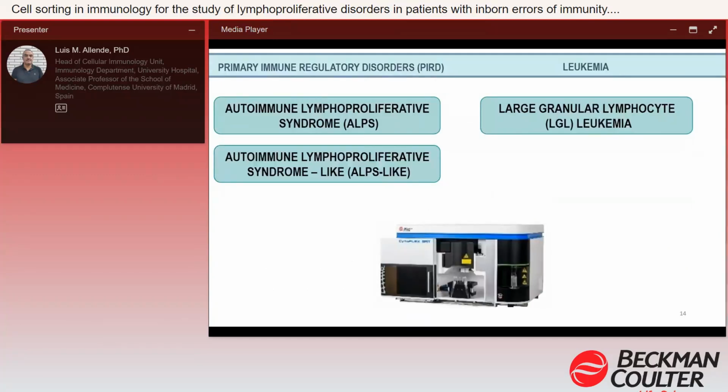I would like to show some applications in our Department of Immunology where cell sorting can make a decisive contribution to diagnosis, validation of molecular variants, or treatment monitoring. Firstly, I will show the diagnosis strategy for identification of somatic mutation in an autoimmune lymphoproliferative syndrome. Secondly, we will see a functional validation of a germline mutation in a deficiency of TET2. And thirdly, the discovery of somatic mutations in new genes in chronic NK-LGL leukemia can help to identify new molecular subtypes and personalize the treatments.